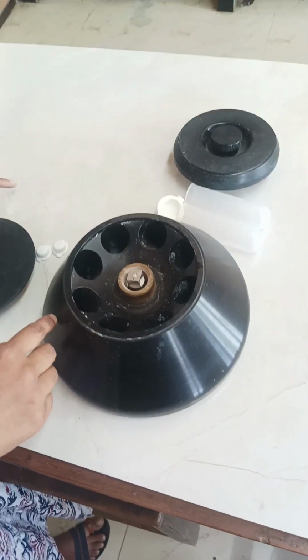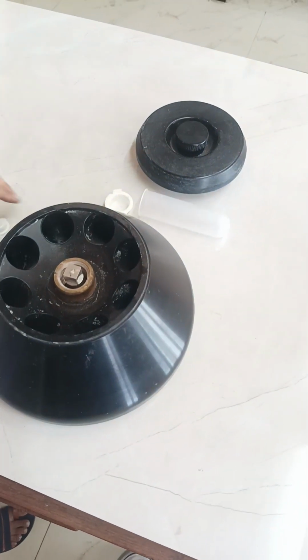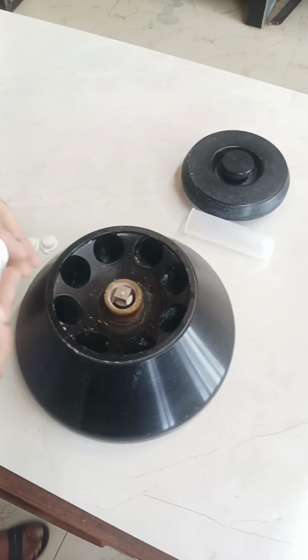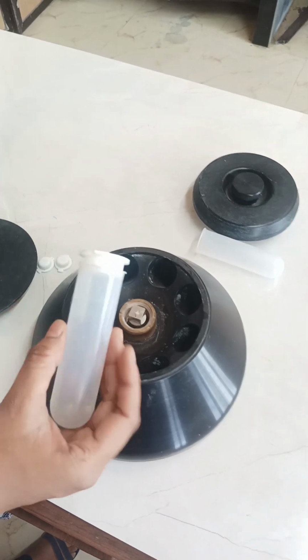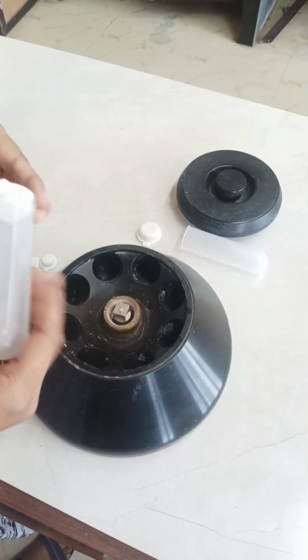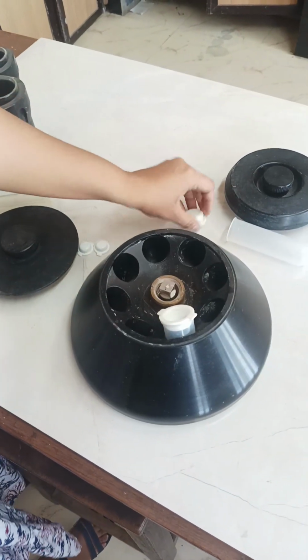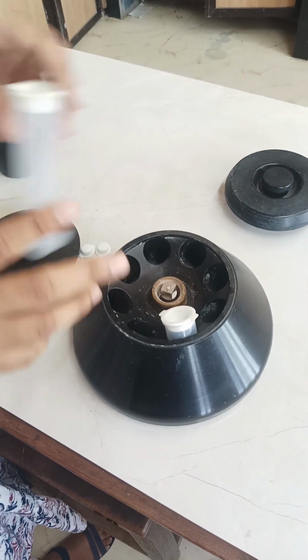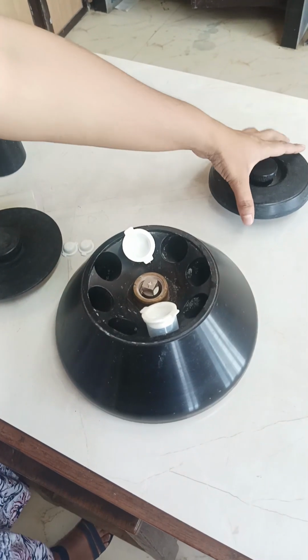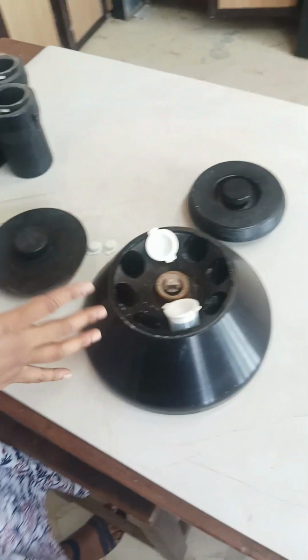Now we will go to another type of rotor which has a capacity of 8 tubes, and these kinds of tubes go into it, having a capacity of 40 ml. Almost 40 ml of volume goes in here. Similarly, you have to lock it properly and insert these tubes, and then put this rotor into the centrifuge in this manner. You have to cover it with the lid of the rotor. So these are three types of rotor.